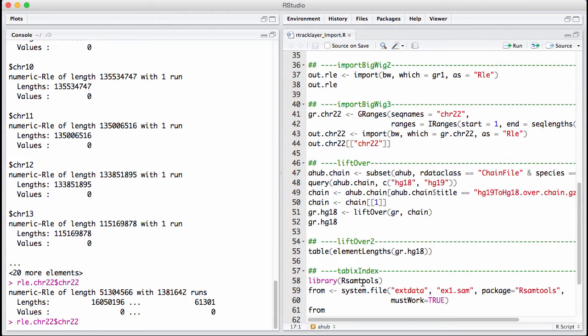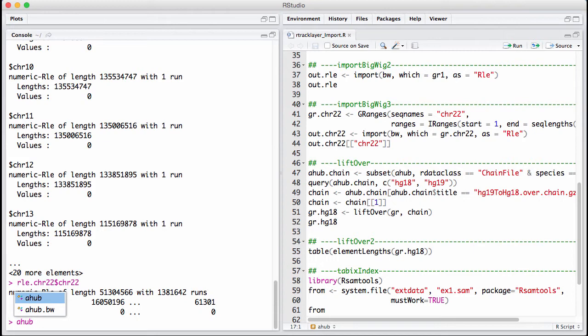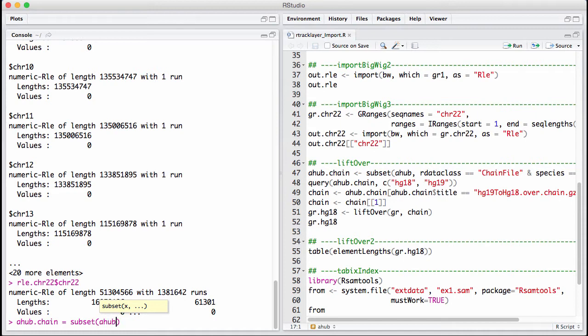A chain file contains information about converting one specific genome to one other specific genome. And these are accessible from AnnotationHub. So let's look at AnnotationHub. Let's say our rDataClass is equal to chainFile.